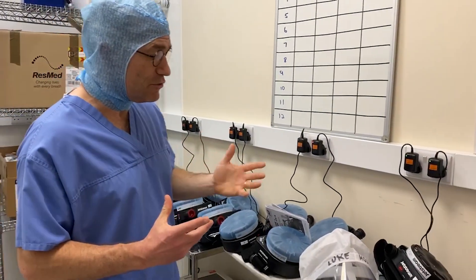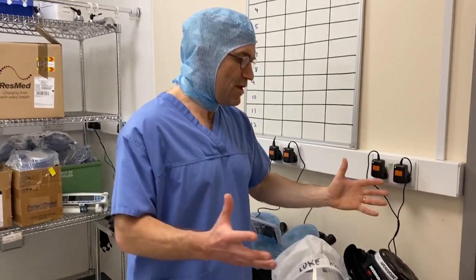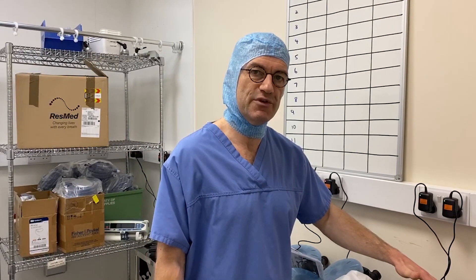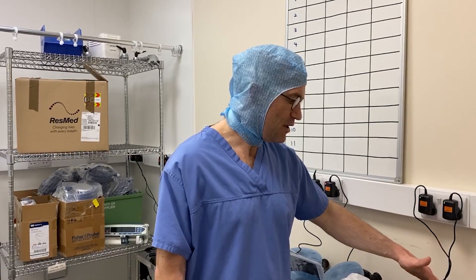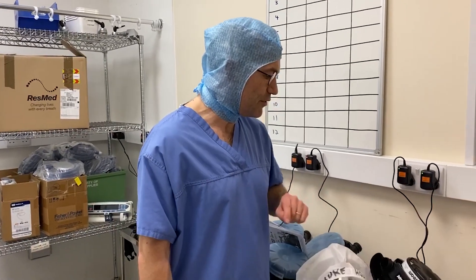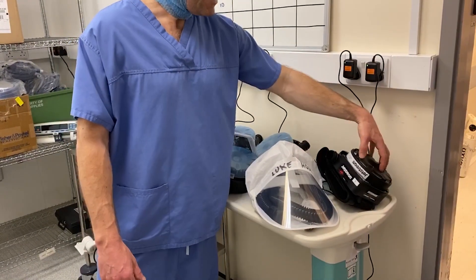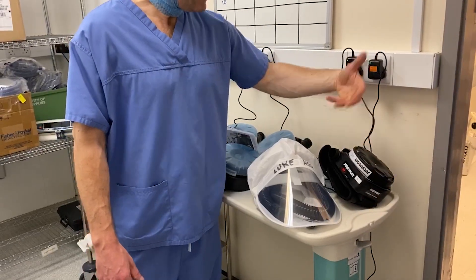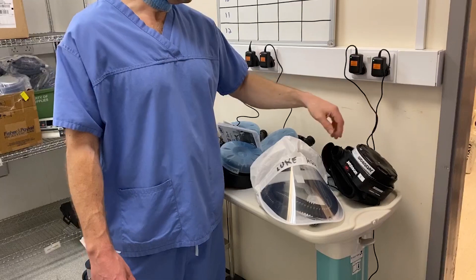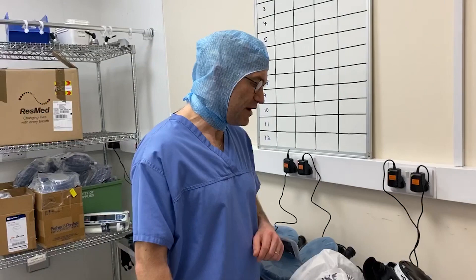These filters will probably last about 28 days, assuming they're used for eight hours a day. So we need to keep a log of these filters and how much they've been used. You can also use a flow meter to check the flow through the filters — often they're used for dusty environments where they clog up and flow drops, but we're not anticipating dust so we'll have to go by duration.